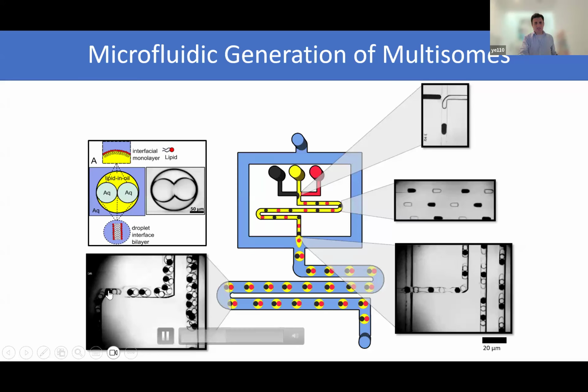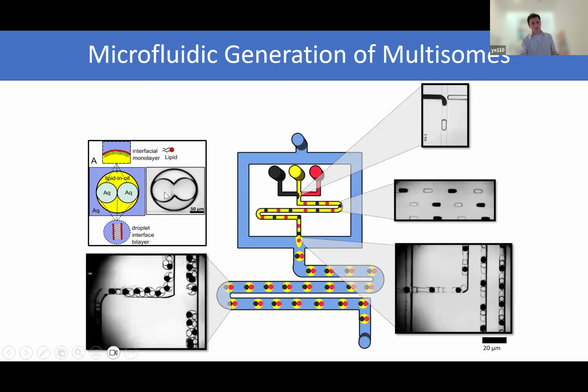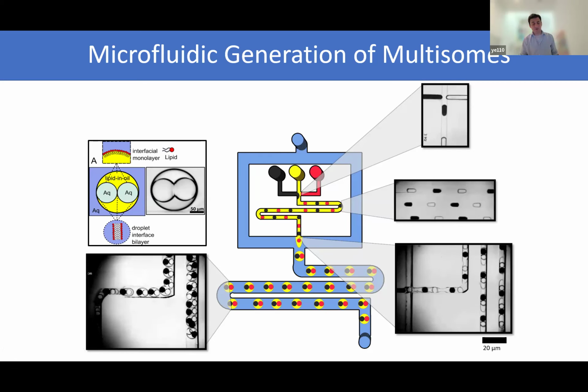So this is a multi-compartment synthetic cell, and you have lipids in the solution, so you basically have a lipid between the internal droplets and a lipid between the internal droplet and the external droplet. Hagan Bayley was actually the first to demonstrate that these things can be formed by pipetting, but we've developed the microfluidics method to make them in high throughput.